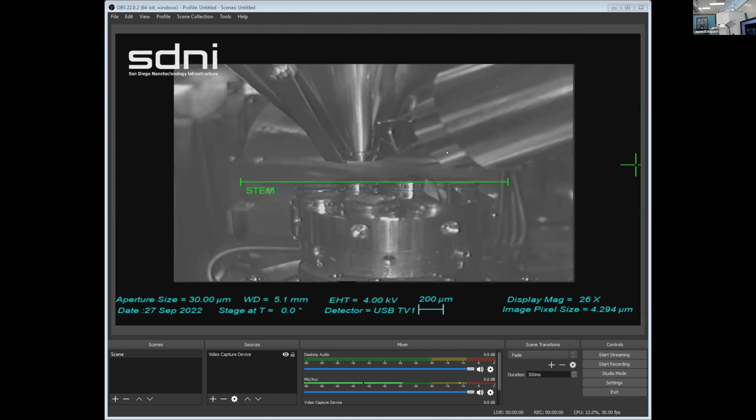And then these are typical sample holders. We call them round carousels because they look like a carousel. Each sample, except that B that's stuck in the middle, is mounted to a small chip, which you can take on and off to customize which samples you want to look at.